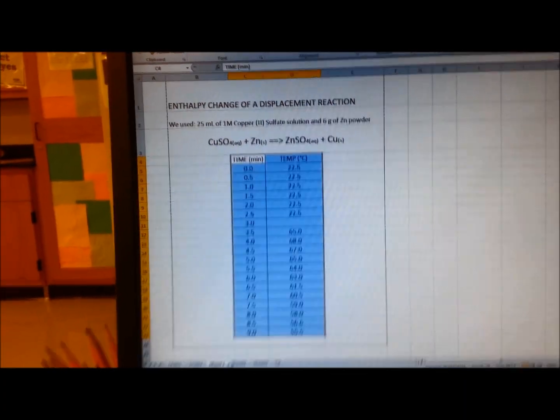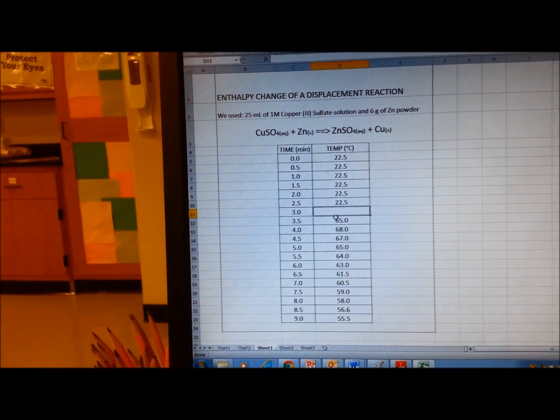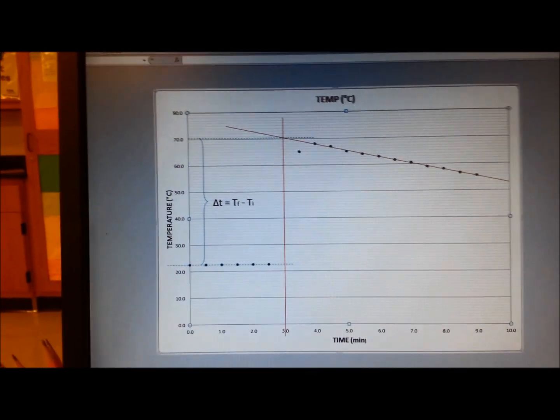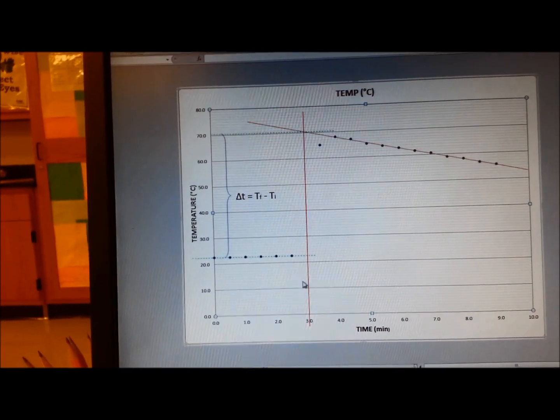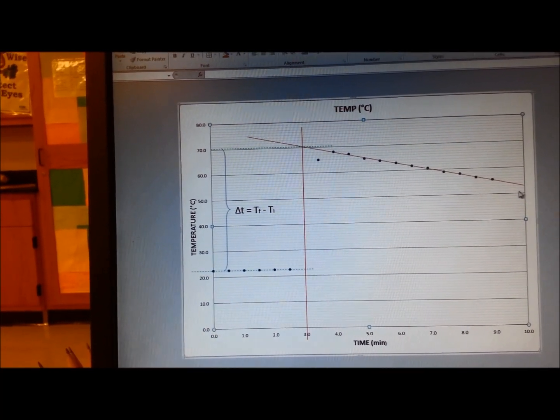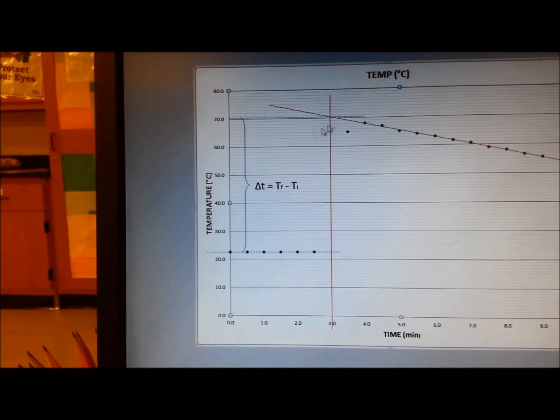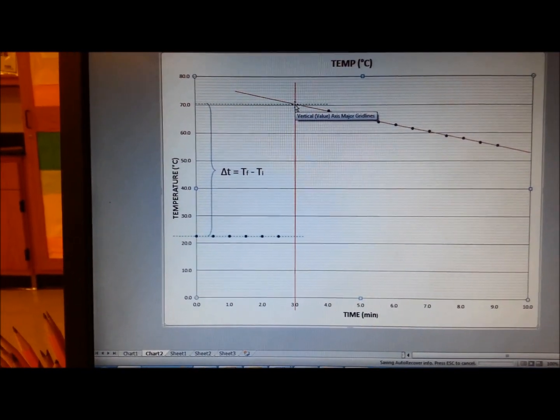We plug all the information into Excel and develop a chart with only the data points. We add two red lines: one is a best-fit line for the decrease in temperature after the maximum temperature was achieved, and one vertical line at exactly 3 minutes. That vertical intersection gives us the theoretical maximum temperature that would have been obtained if there were no thermal inertia.